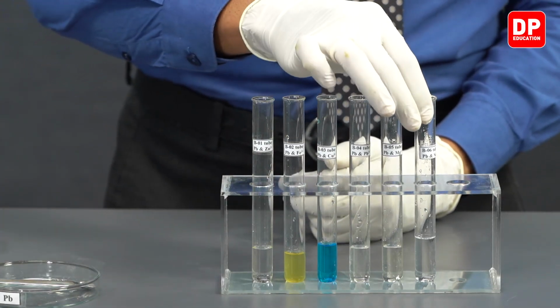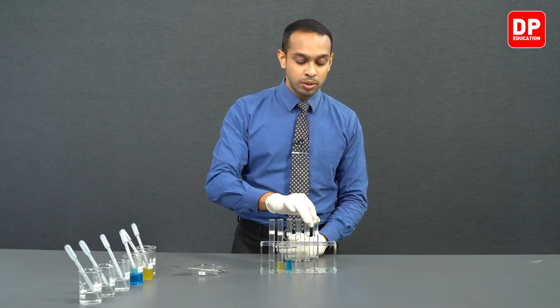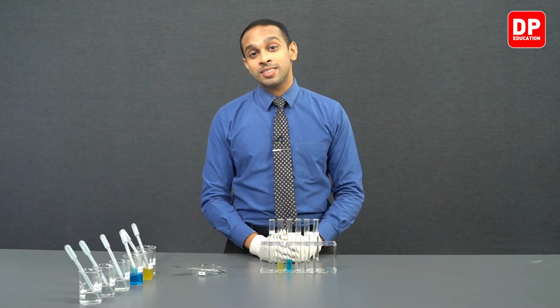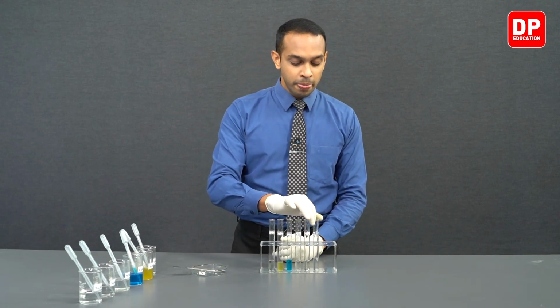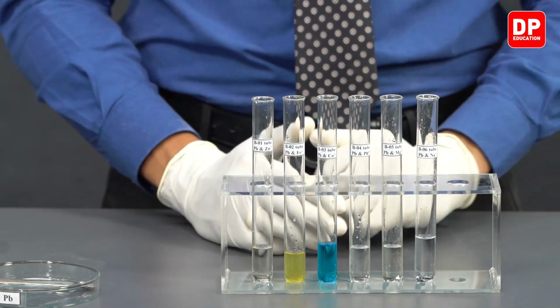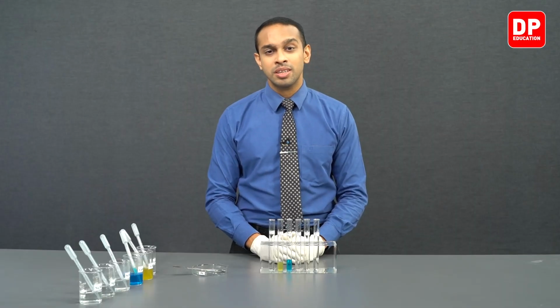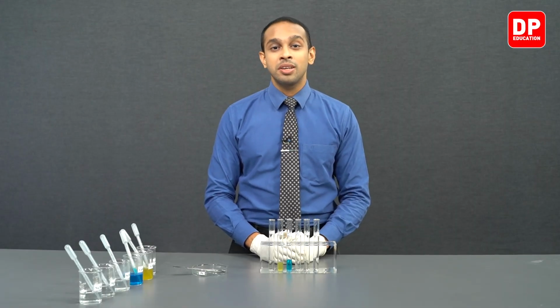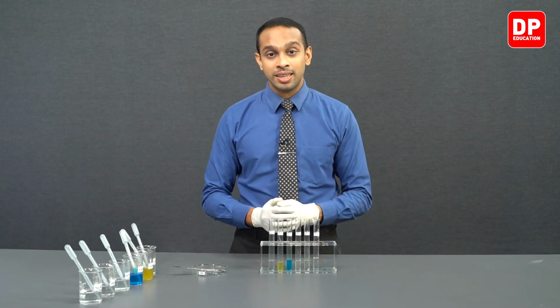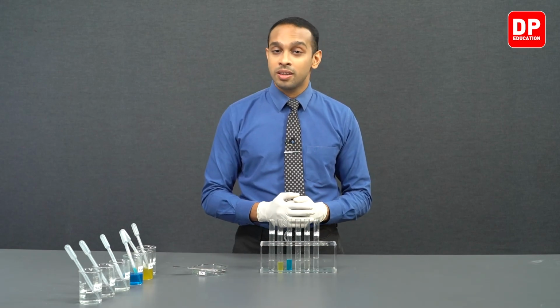However, when it comes to lead, you don't observe that. Lead easily sinks to the bottom because lead is a heavier metal than copper. So it will not be remaining on the surface of the aqueous layer. Instead, it will directly sink to the bottom. One of the very small observations you can make, and you can develop an idea about how the densities of different metals vary when you are carrying out an experiment like this. Copper is a lighter metal than lead.